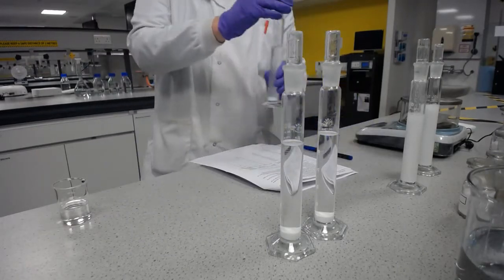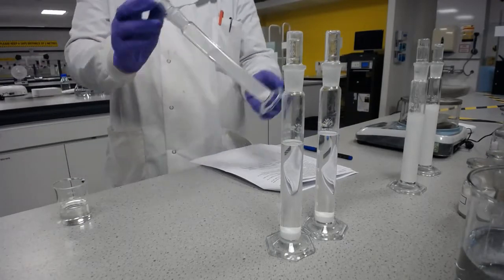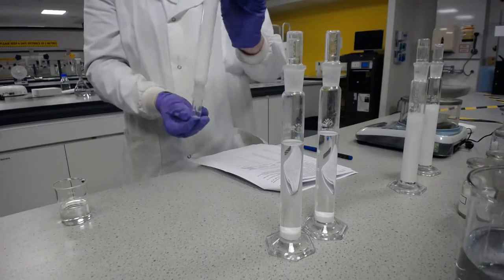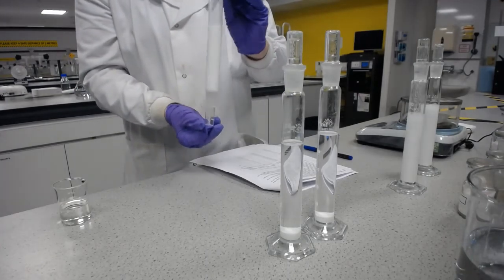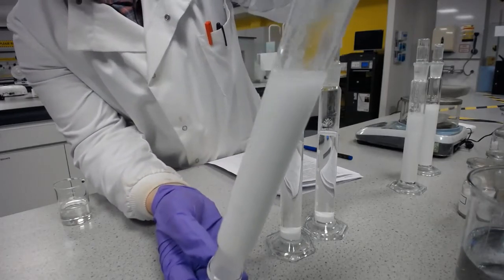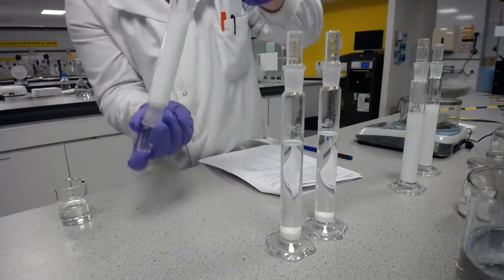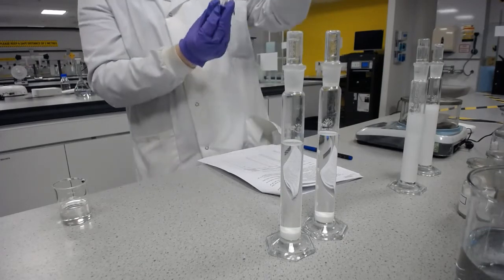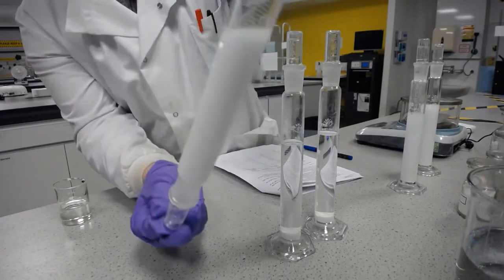And how many inversions are we going to require? 1, 2, 3. We've still got a little bit of a mess at the top with a few lumps. 4, 5. 5 looks pretty good to me.